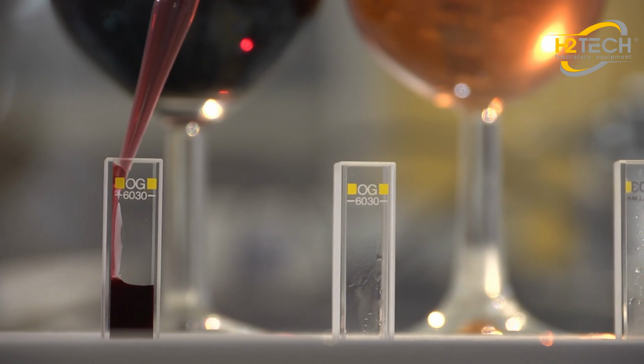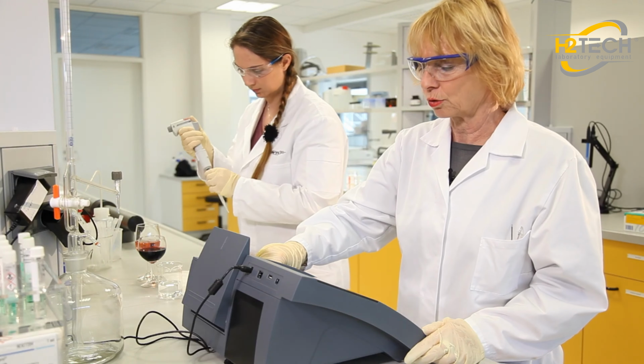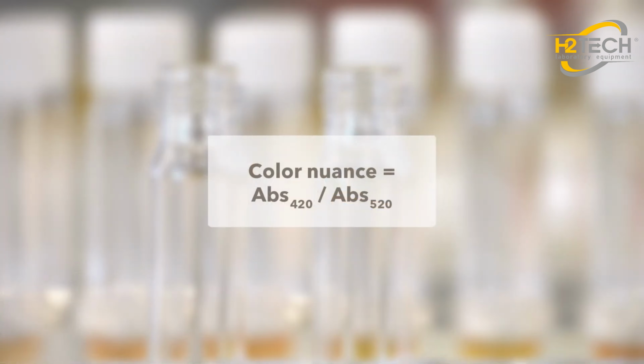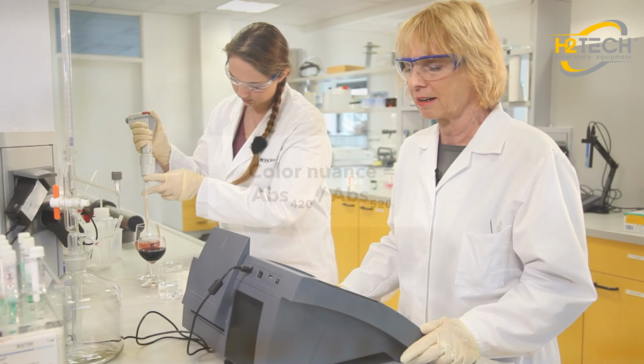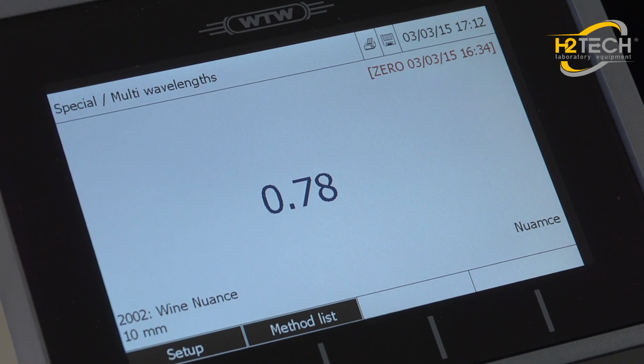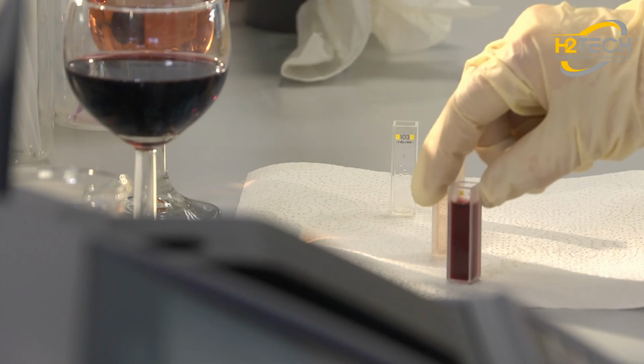First of all, I'll determine the color nuance of the red wine. Color nuance is the absorbance ratio between 420 and 520 nanometers. In other words, two wavelengths are measured and then calculated against each other. We have a reading of 0.78. For us, this means that it falls in the violet range.